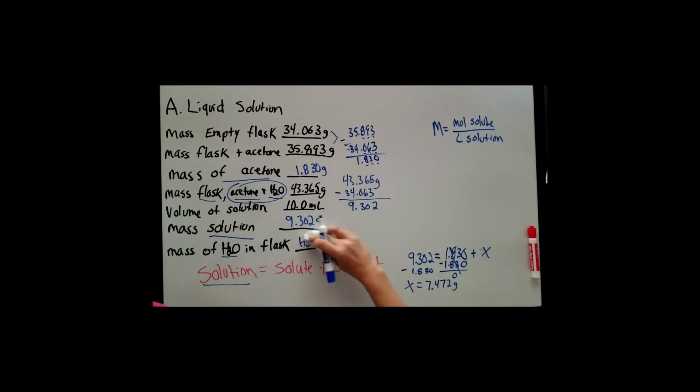So another way of looking at this is our solution in this case is made up of acetone and water.